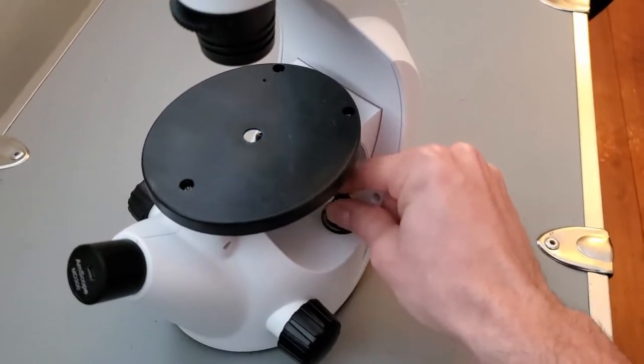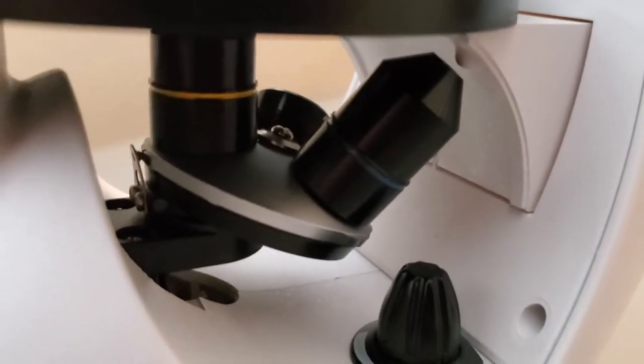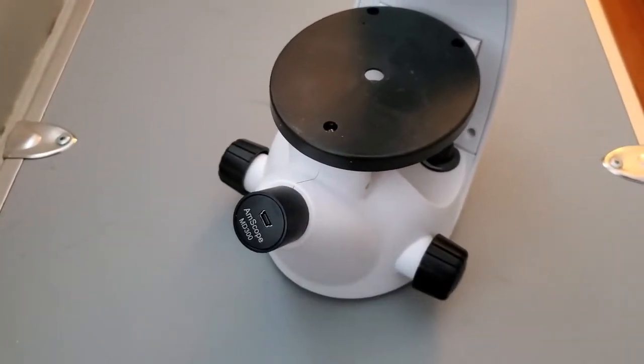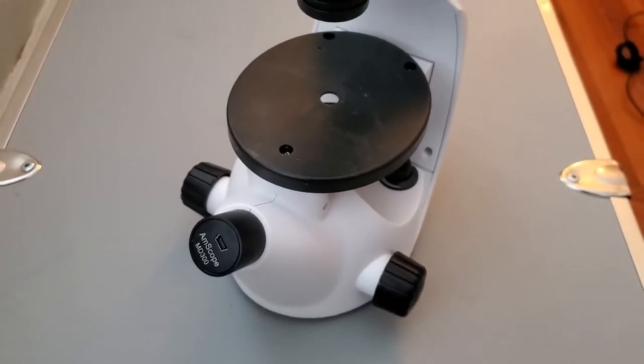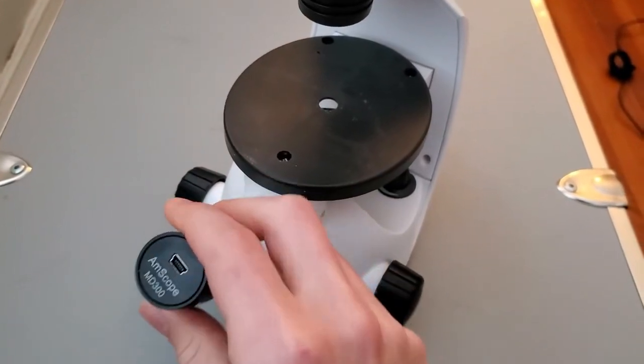You've got your three objectives, so your 4x, your 10x, and your 20x, and then the actual eyepiece. You can have an additional 10x or so increase, but really the important part of this setup is this USB camera.